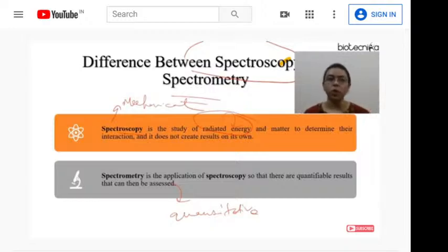And when we talk about the recent technical innovations in mass spectrometry, these have contributed to a range of highly sensitive and versatile instruments for high throughput, high sensitive protein profiling. Definitely we always think of mass spectrometry.